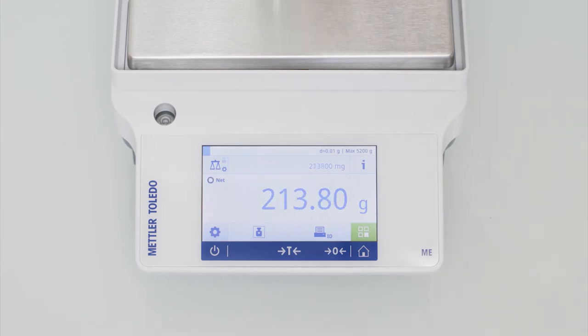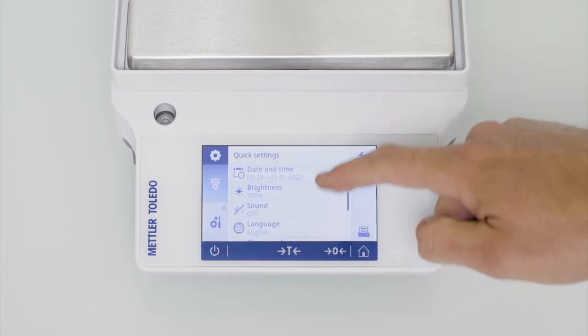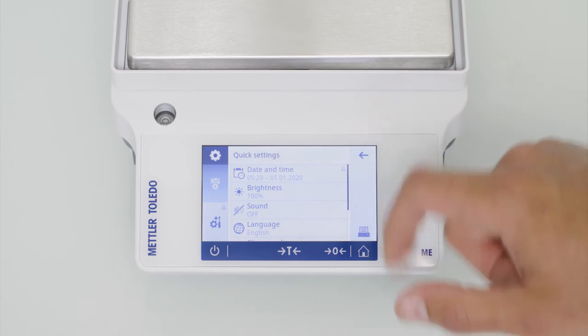The large color touch screen simplifies balance operation and is easy to read. The intuitive interface provides user guidance helping to reduce errors and providing fast access to built-in applications.